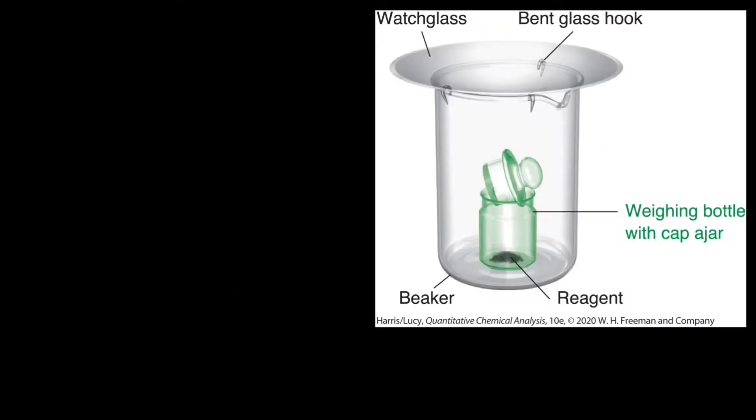In order to dry and weigh our samples in the lab, it's common to place them in a previously weighed weighing bottle. A weighing bottle is simply a glass vial that has a tight-fitting lid on it. We can dry our sample in a weighing bottle by placing it inside of a beaker.